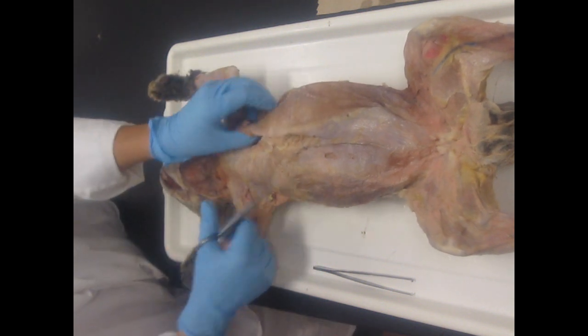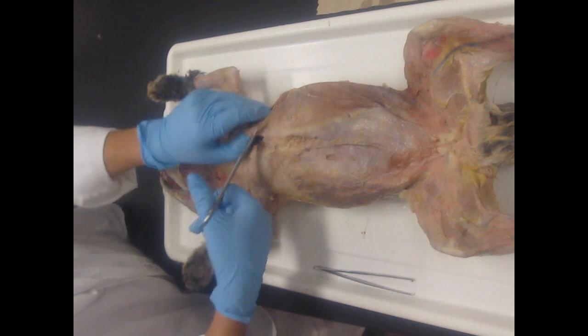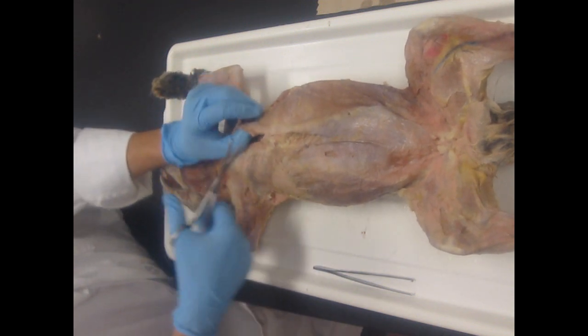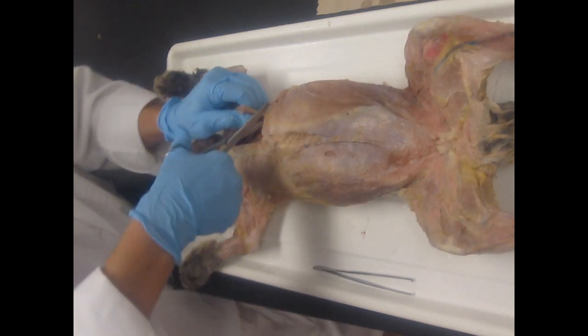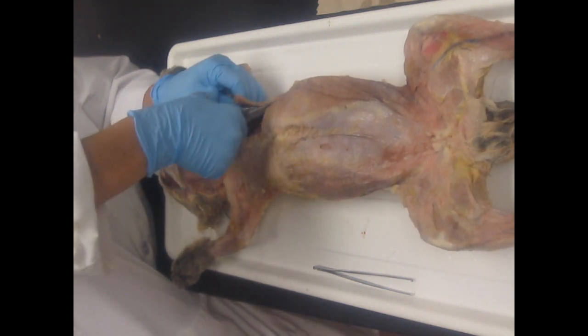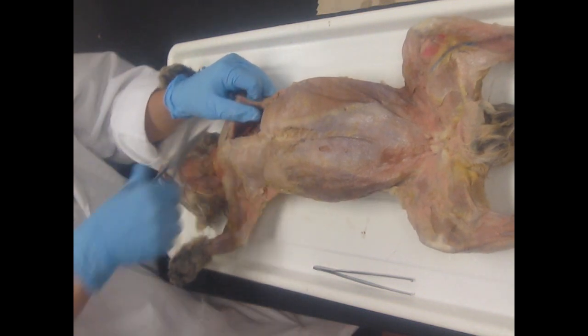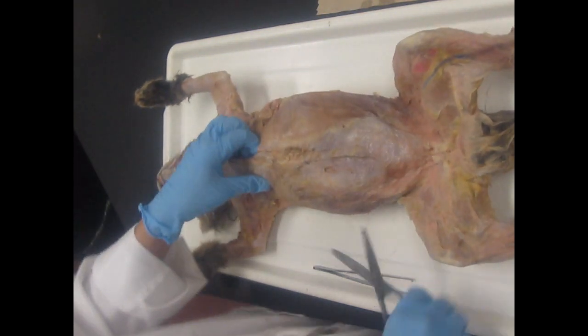Now you're going to make a lateral incision that follows the diaphragm. You're going to lift up so that you don't cut the organs inside, and make an incision down along the lateral side. You may have to go through a couple of ribs. Ribs tend to be pretty thin in the cat. Shouldn't be too hard to go through.